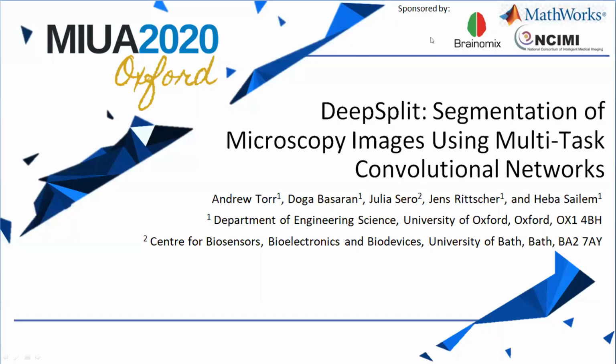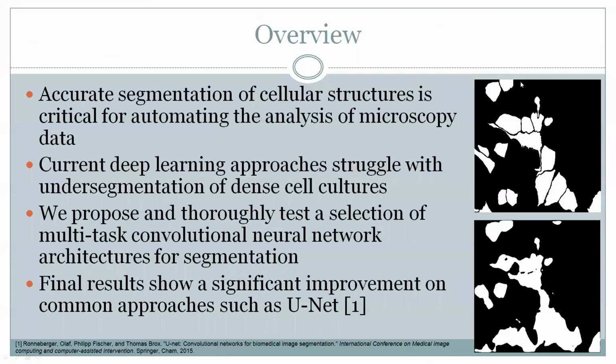Hi, I'm Andrew Torr, and I'm going to give a quick overview of our paper on DeepSplit. So the overall goal of this work is accurate segmentation of dense cell cultures using convolutional neural networks.